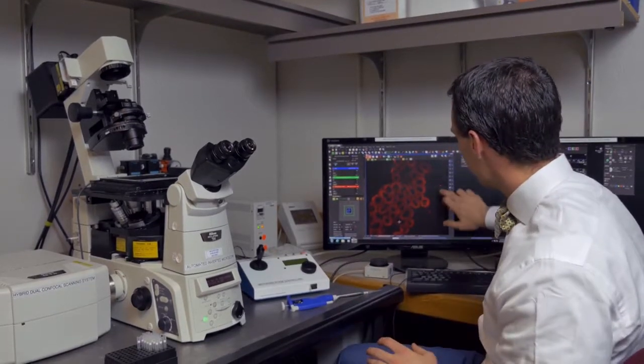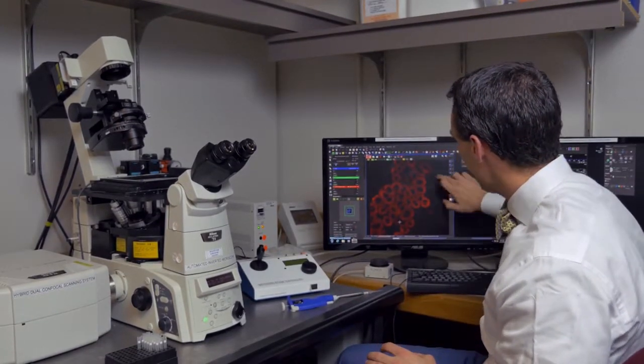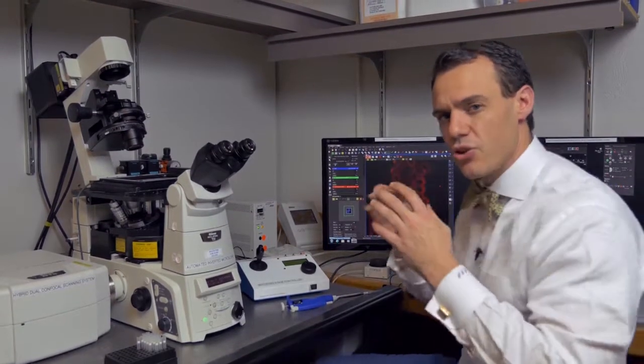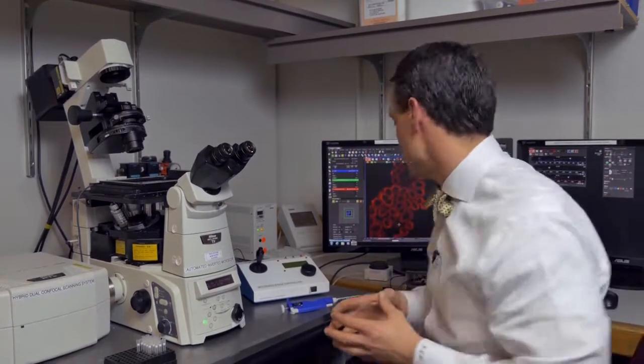Now what is interesting is if you look around here, there's not nearly the red concentration that is inside the cell, suggesting that there's so much more than just passive diffusion of these essential oils across the cell membrane or plasma membrane. There is actually enrichment or seeking out of these constituents, and the cells will ultimately take them in and retain them, giving it what is termed the active part of cell active and permeable.